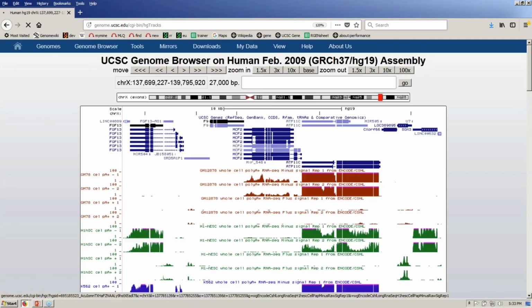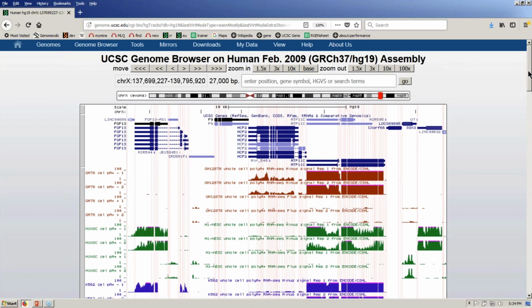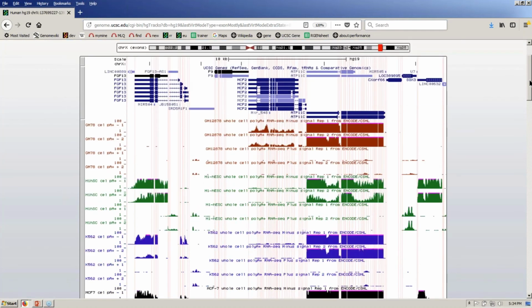and it's thrown away all of the introns. You can see here that we've drawn the virtual chromosome that's been created from this is 27 kilobases in size, and it still spans the 2 megabases that we had on the screen before. But each one of these little pink lines in here represents a missing piece of DNA, be it an intron or an intervening region between genes, an intergenic region. You can see that some of the little 12 base spaces are here. This little white space or little thin white lines on the browser.